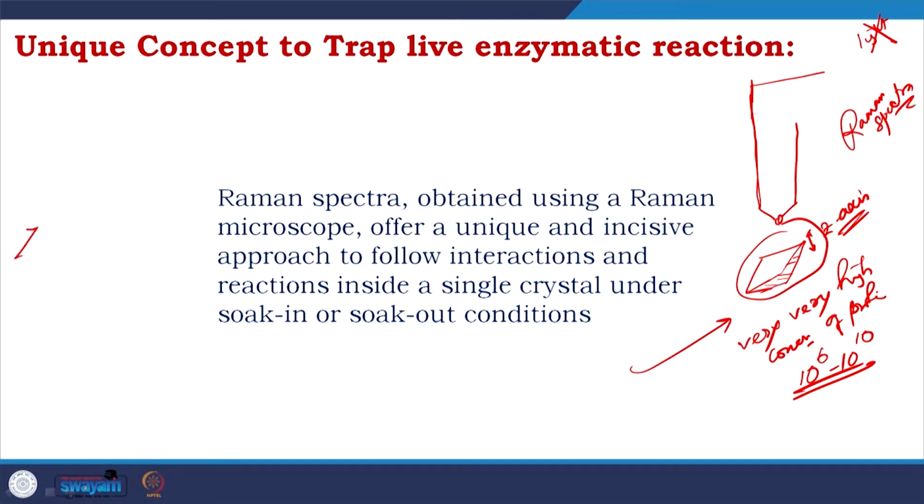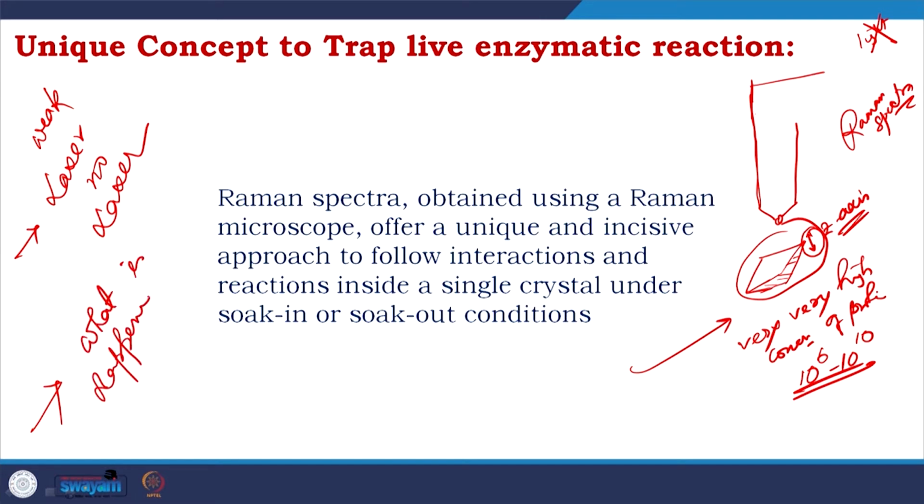Second advantage: because you get that high, you could use very weak laser or no laser. Third advantage, you are only scanning the Z axis. So, you only look at what is happening inside the crystal.